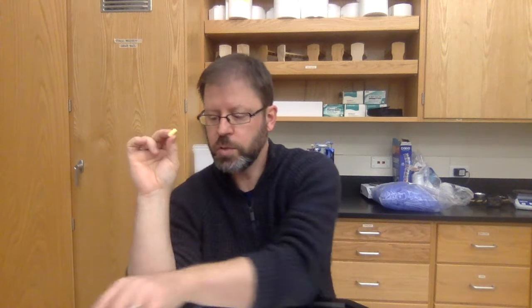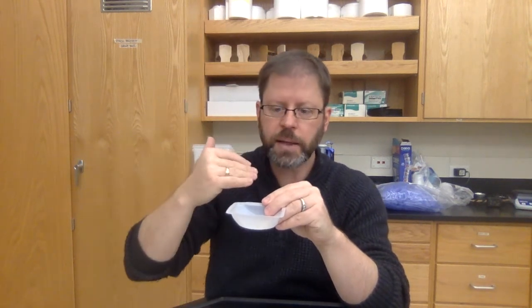So your process is going to be to get a known quantity of vitamin C out of this, assuming that this contains 1 gram of vitamin C. So you're going to weigh the tablet, and you should immediately be able to get a proportion out of that.